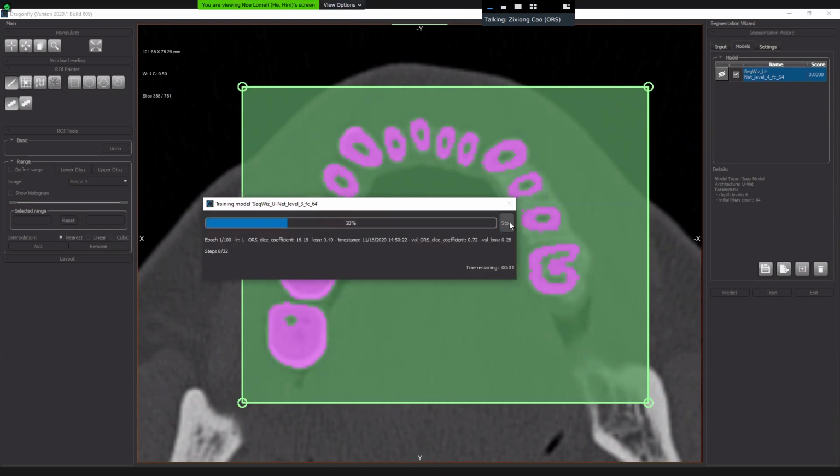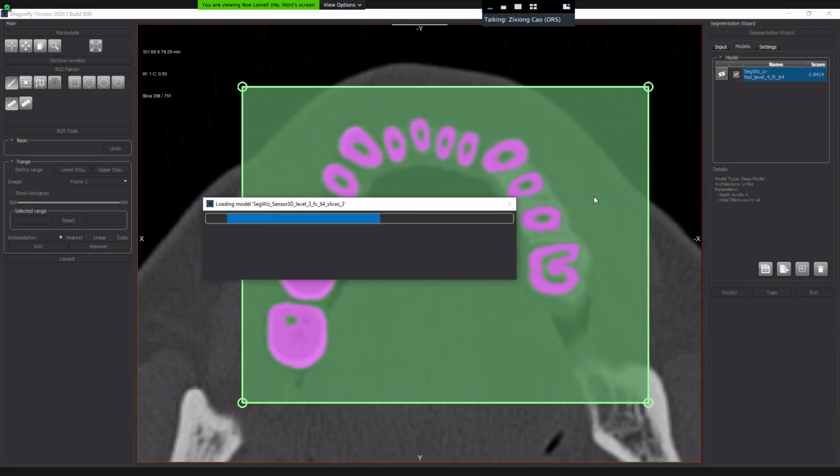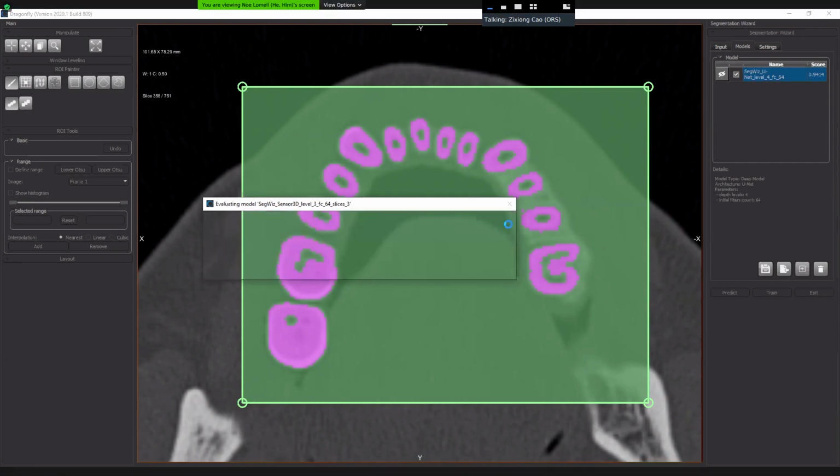It's training some automatically generated models, not the model we created manually before, because the program will create some suggested models for you. Some of them are useful, some of them are not very useful. So personally, I don't use them every time. I just skip them. But because I didn't see the skip message, it's training now.